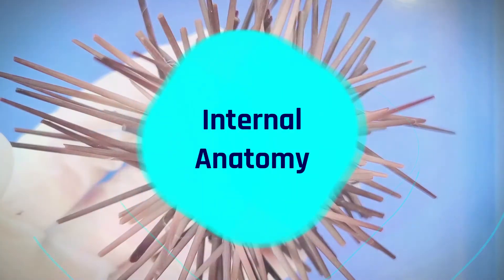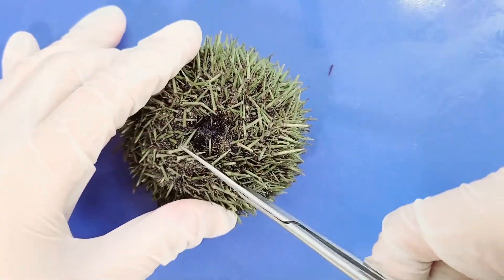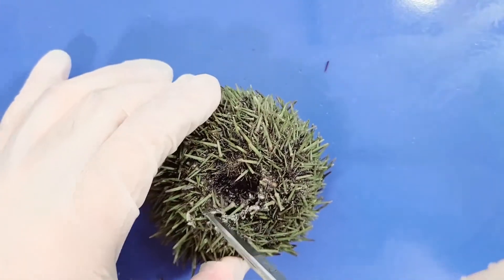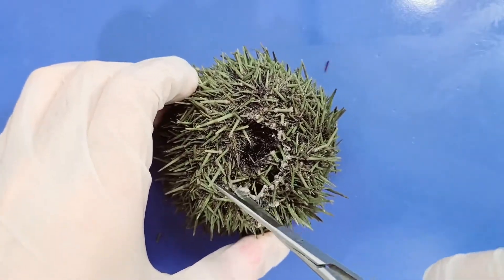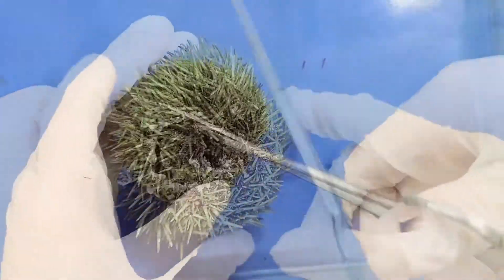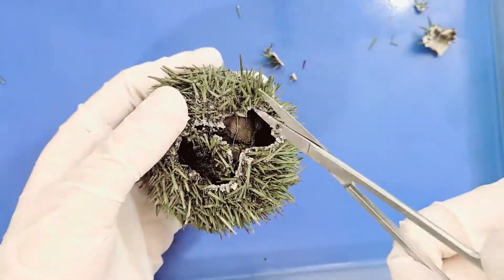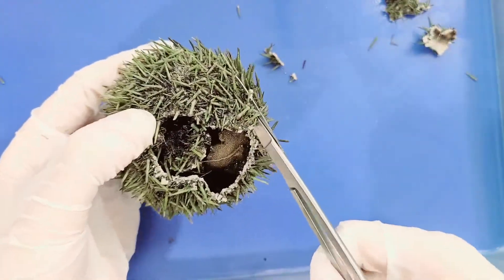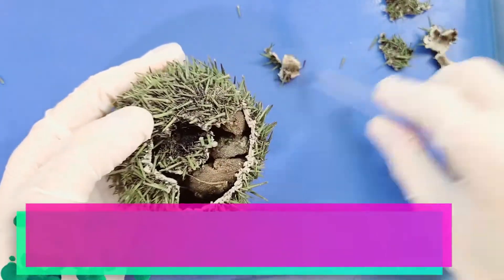Now let's take a look at the internal anatomy. First, carefully insert a scissor blade close to the top of the aboral surface and use the scissors to cut around the periproct. Then make an incision down the side until you reach the halfway point, cut around the sea urchin in a complete circle, and carefully remove the test and small pieces along the way.